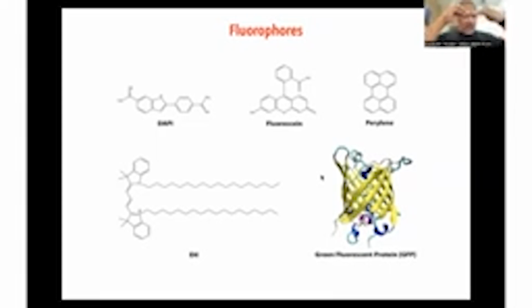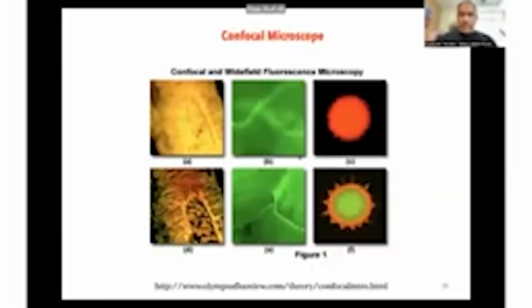It's like adding a bulb to the protein, right? And this bulb will glow the moment light of a particular wavelength hits it. And when I say it glows, that means it is emitting light at a particular wavelength, right? And so that allows you to see these molecules in a way that you would not be able to otherwise, right? And so this can be used to look at different aspects of how cells, or different things inside the cells, work.